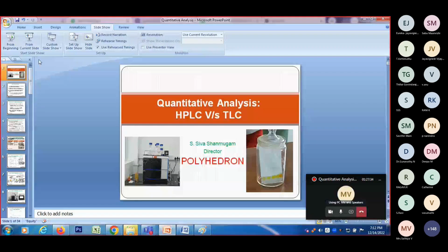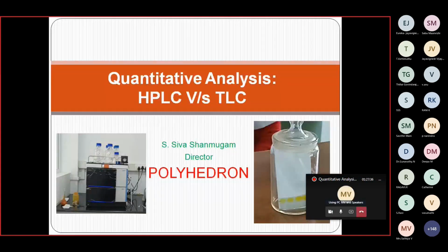I'm planning to share the screen with you now. So let's get prepared for the presentation now. Topic is quantitative analysis by HPLC and TLC.